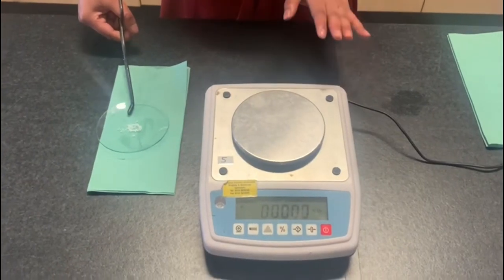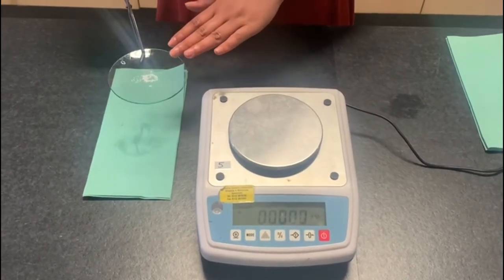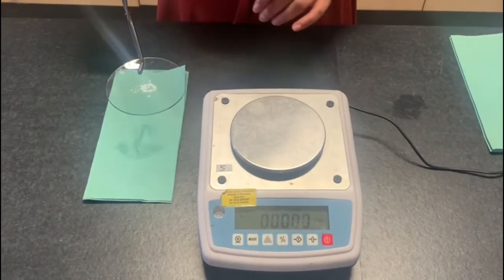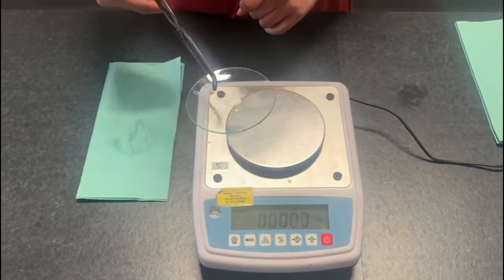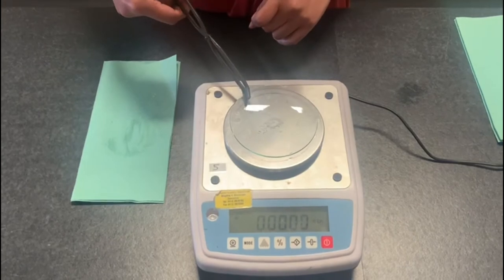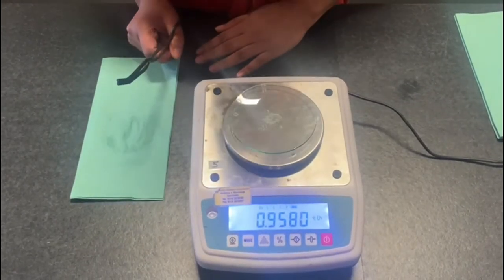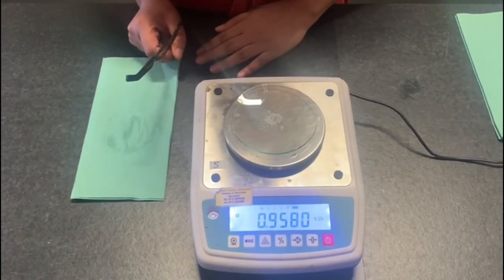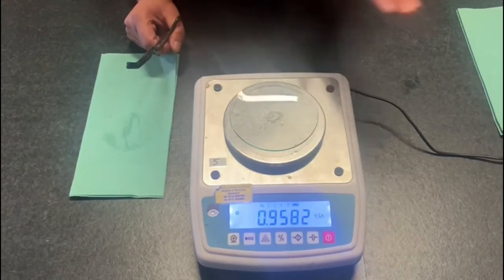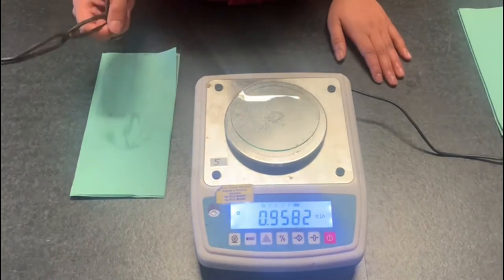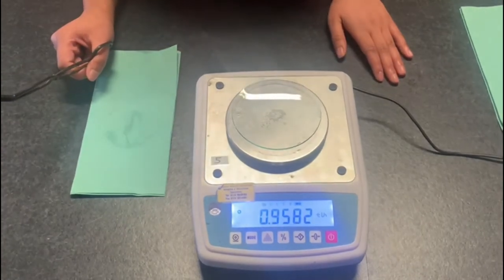Okay we now need to measure the mass of both the dissolved solid and the watch glass but we need to make sure that we start off with the balance on zero. Okay that is 0.958 so we need to record that value onto our table and we need to calculate the difference.